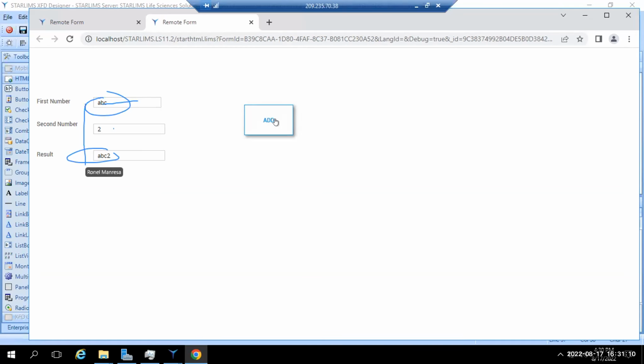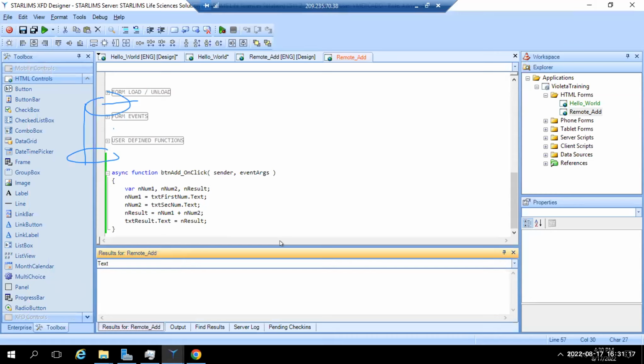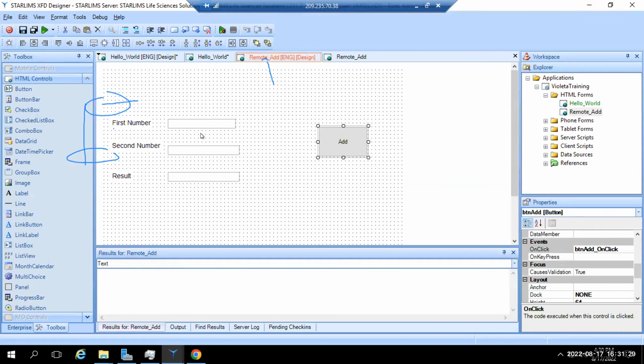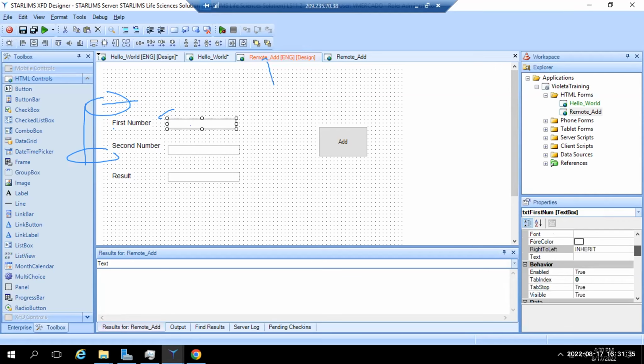So yeah, Deji, that's exactly it, because of strings. So let's go back to your program, and we have to drop because I stole 30 minutes. Let's make some changes here, Violeta. So change number 1, go to the form itself, and then click on the text box. And then let's look for some properties. We know we expect numbers in there, right?